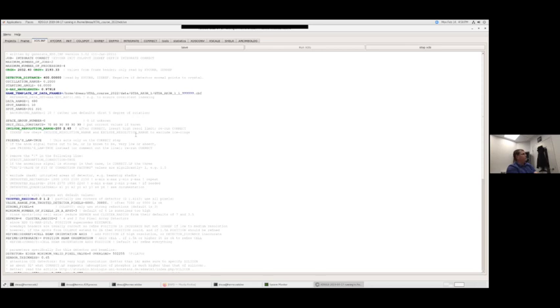But you can also see that the biggest computer processing power was the integrate step. So you might save a couple of minutes on the colspot by doing something like this, but you're going to have to let it run for 20 minutes, half an hour on the integrate anyways, or even longer if you have a long data set. It might not be worth it.